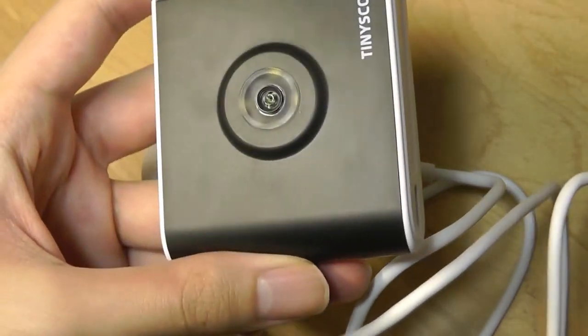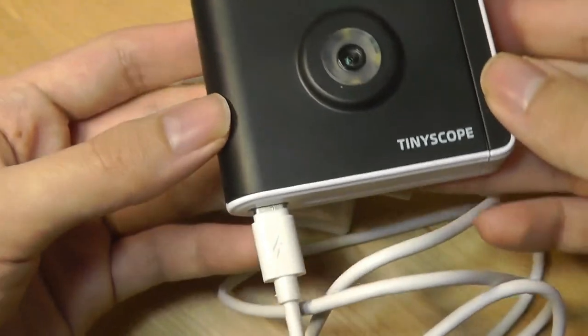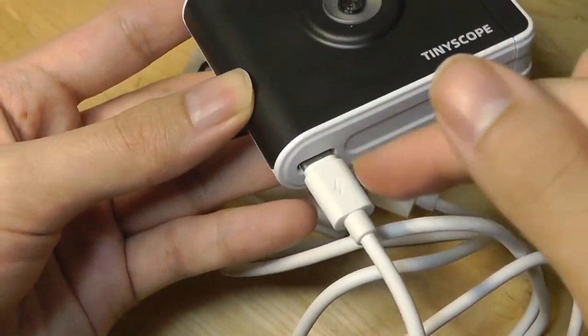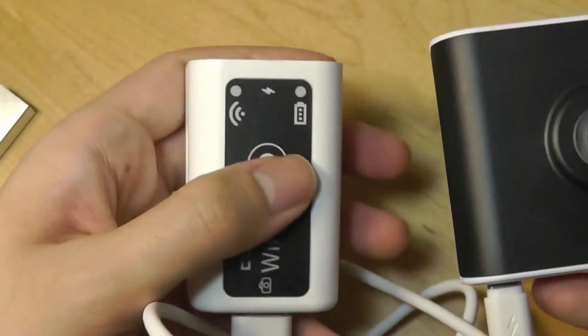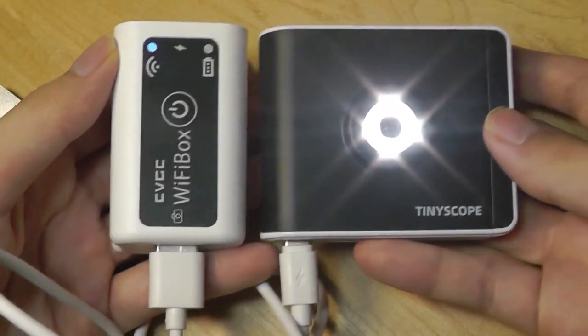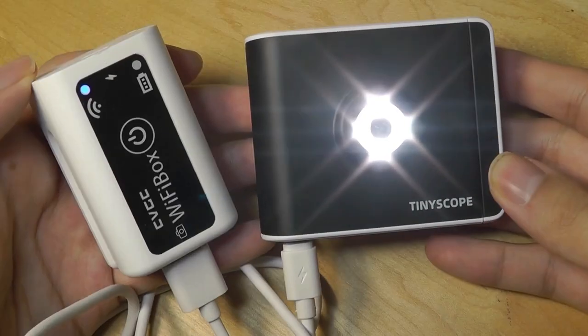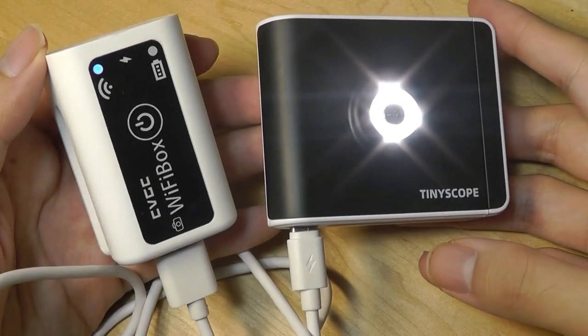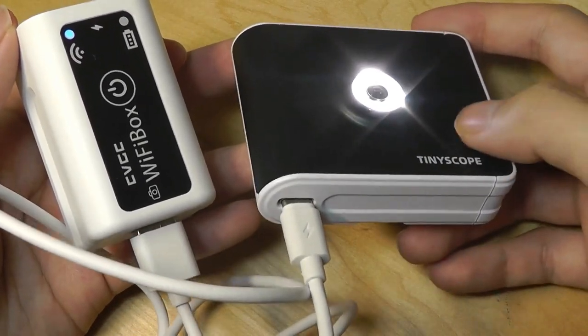It is pretty simple to set up — I'm glad to see everything is using a modern Type-C port. Basically, if you want to use it in Wi-Fi mode, you plug in the Type-C on the camera and the other side goes into the USB socket of the Wi-Fi box, tap once to turn it on, and then you're ready to go. What I will say is perhaps in the future they can consider building in the Wi-Fi card as well as the battery in the camera itself, which wouldn't require a separate little module that you have to carry around.